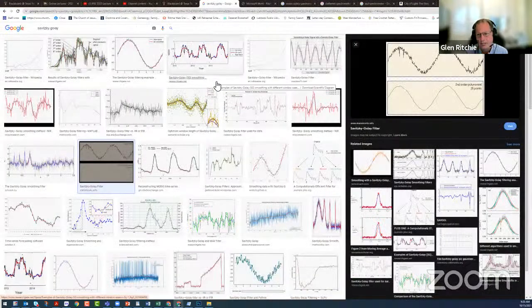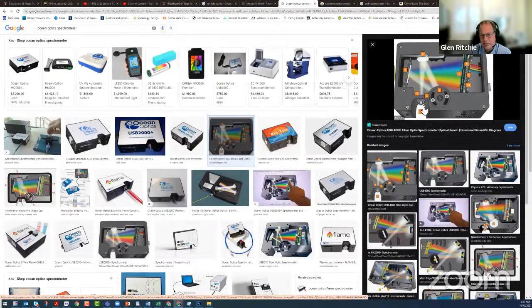So take home summary from today. First of all, a spectrometer is an optical instrument that is used to measure reflectance by wavelength. You disperse light through a slit. You bounce it off some mirrors to increase the length over which you're able to disperse the light, and then you measure the amount of light on this photodiode array. You use a fiber optic cable to feed the light into the sensor. You could actually leave the cable off and measure directly from this, but you have to get the whole system really close to the plant in order to do so.